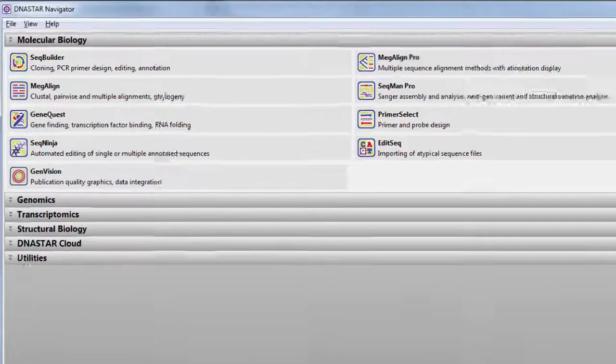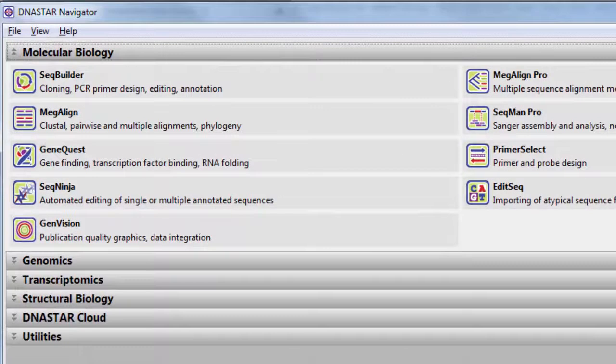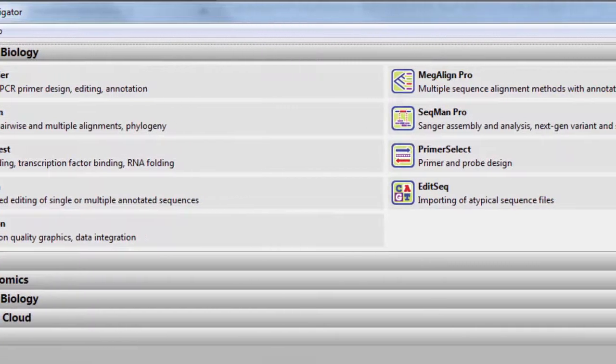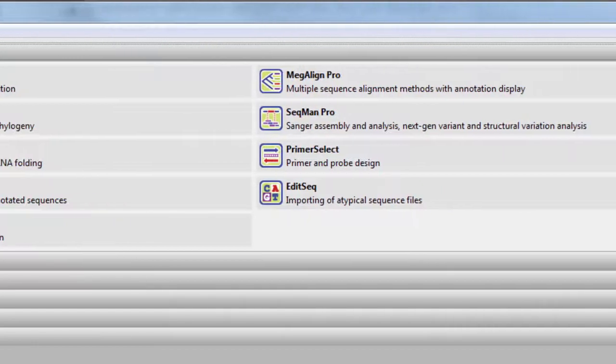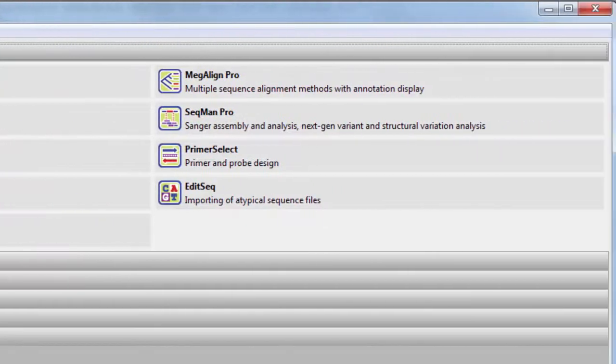The LaserJane Molecular Biology Suite provides molecular biologists with a comprehensive set of tools for sequence analysis.